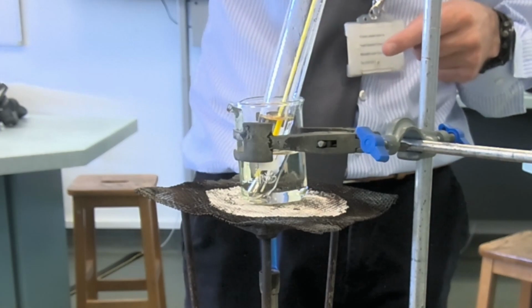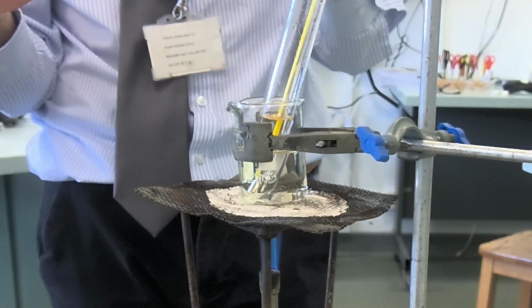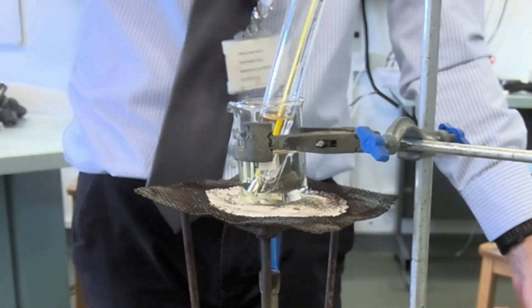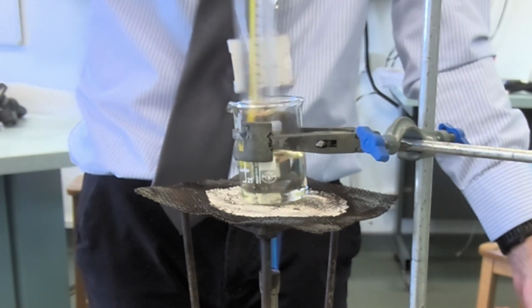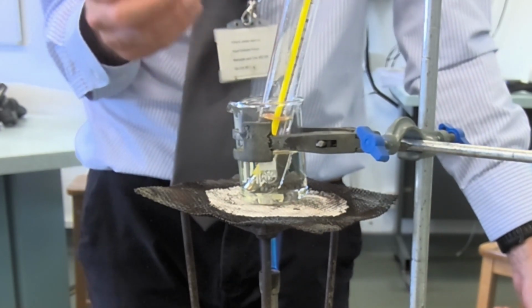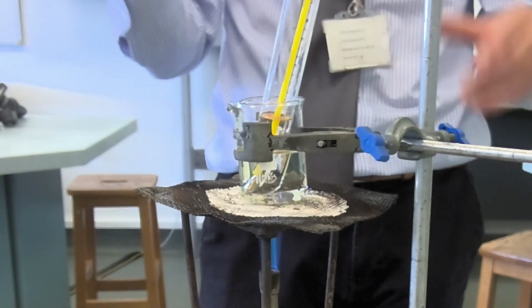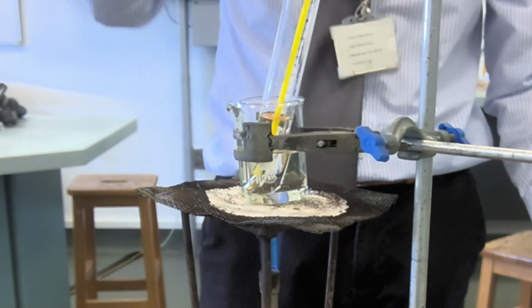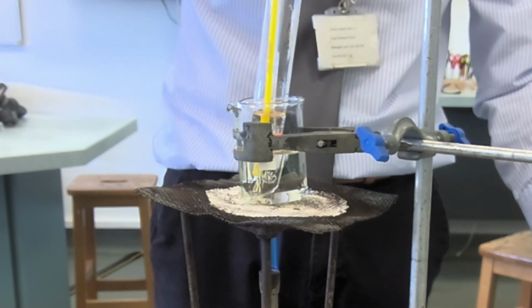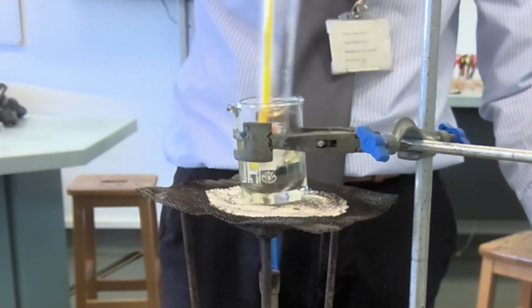The glycerol should never get hot enough to start smoking. Okay, if it looks like there's some vapor coming off it, basically you shouldn't use that hard. You might want to put it down a bit. Sometimes the glycerol is used again and again. It gets water vapor in it, and what you're actually getting is the water vapor steam coming off. So it's okay at the moment. It's just steam. If it was like 150 degrees or something, it would start to smoke. That's a bad thing. Okay, so we're at 95 on here now.